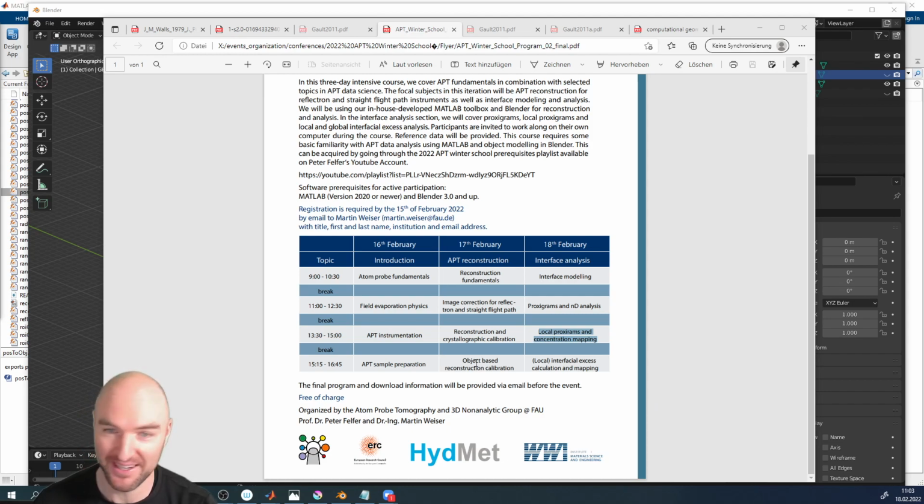Okay, so welcome back to the second part of today. In this part, we're going to look into how to do proximity histograms, proxigrams, from the objects we just created, and essentially from any object.